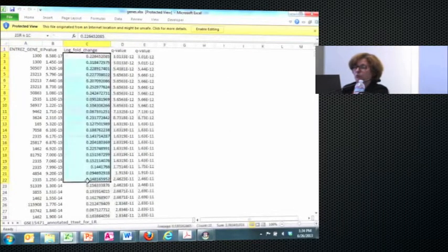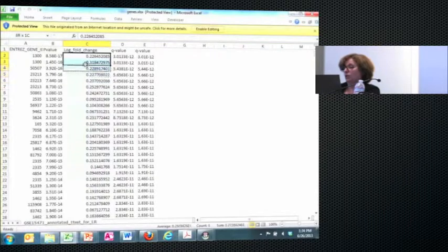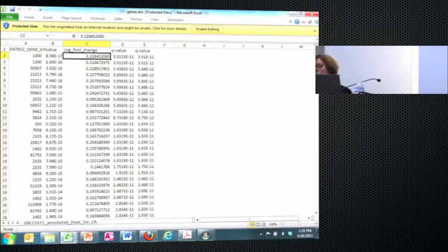And what I want to point out is that a lot of times, for both gene expression and metabolomics data, rather than looking at fold change, people look at log fold change, especially for gene expression, and the program should be able to handle this. It does not matter how many columns you have in a file, because when you load the data, you will be able to map your columns, and I'll show you how to do that.